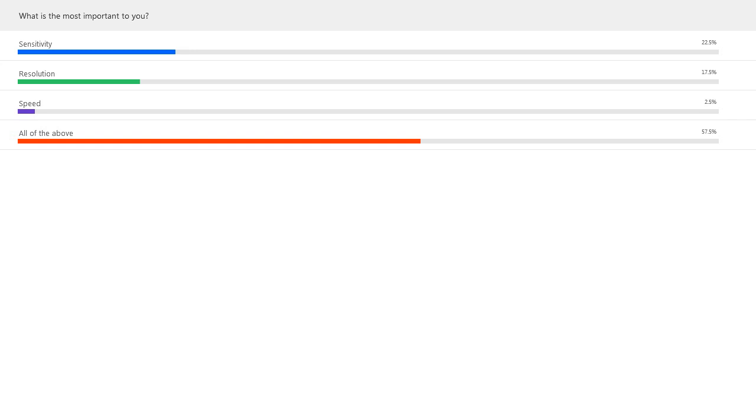I'm guessing maybe we have a lot of people who like sensitivity and resolution together, so you might have had a trade-off there. But all of the above is great to see. And I will encourage you to visit some of our previous webinars where we talk about quality performance metrics of the detectors, and that will touch on some of the finer points of the latest detector technology and how you could achieve all of those all at once.